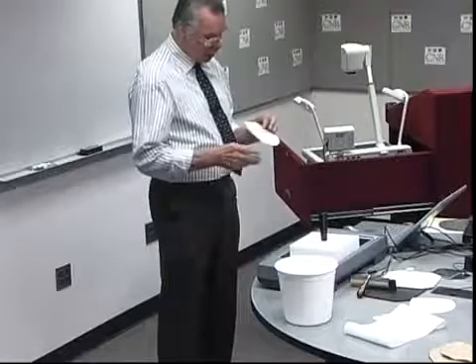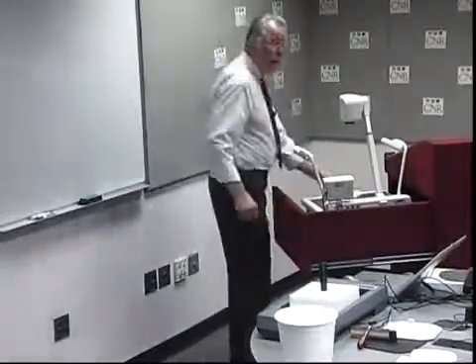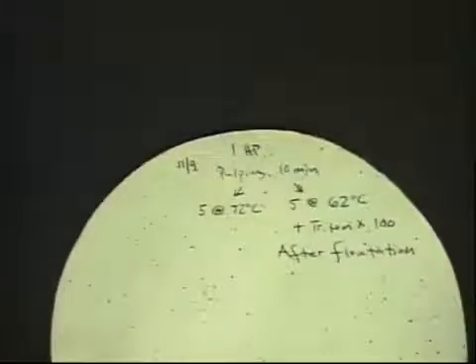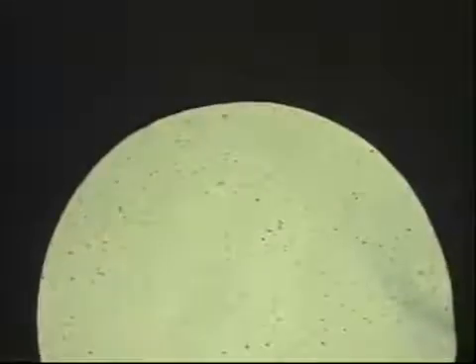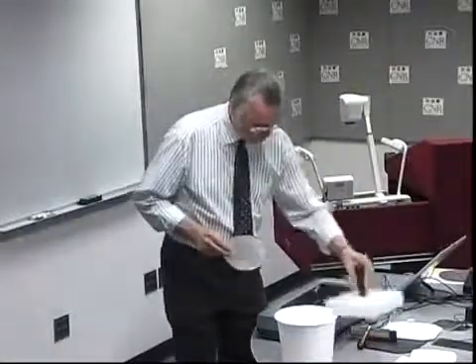This hand sheet has been dried and we've handled it many times, and you can see, perhaps I should go over here again to the table, there is writing on the back of the hand sheet. That is significant. I want to show you what that does in the process. The student has quantified on the back of the hand sheet, with ballpoint pen, the measurement or some notes for his own reference.